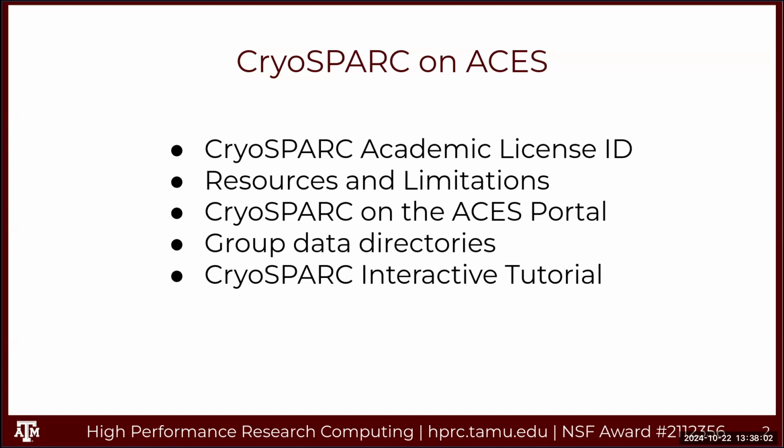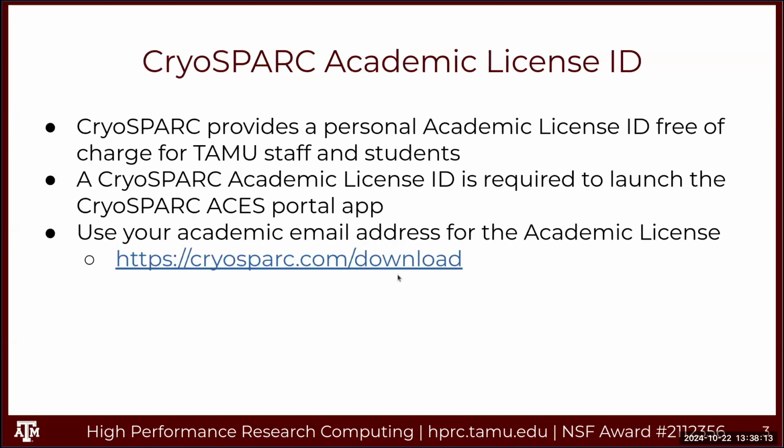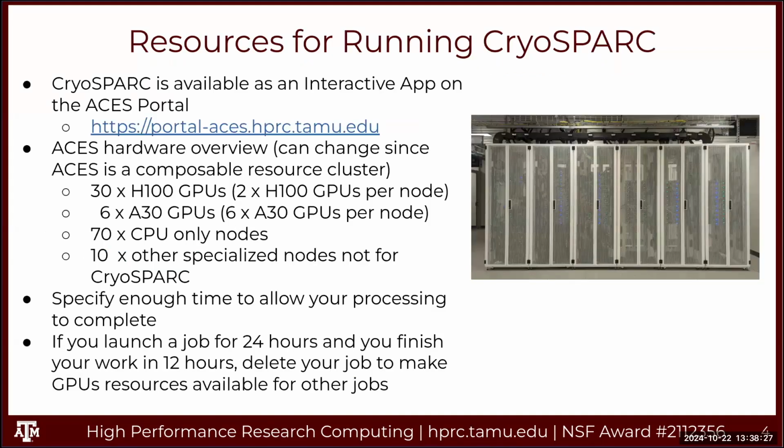We'll go over some resource limitations, and we'll start CryoSPARC on the ACES portal and go over a few other things, and then we'll have the interactive tutorial session. This is where you can download the license. I'll show you the format in a little bit. You'll need that to launch the CryoSPARC job.